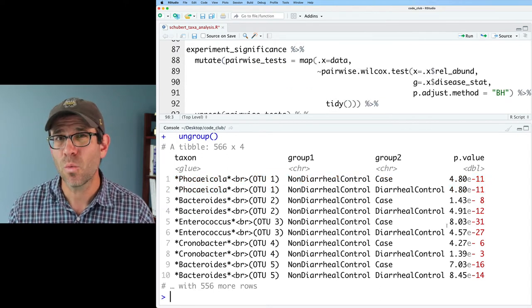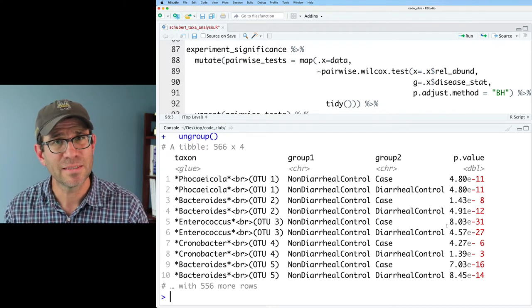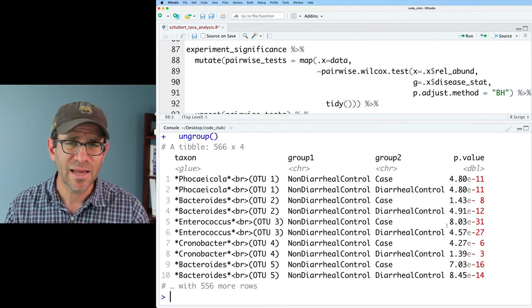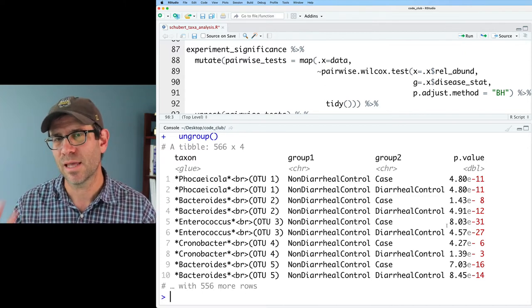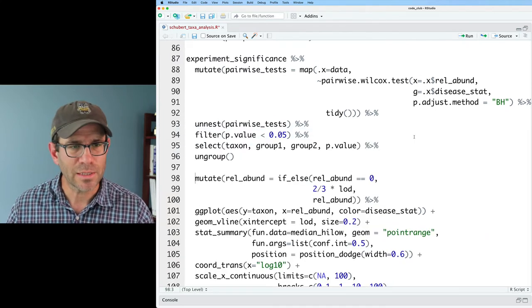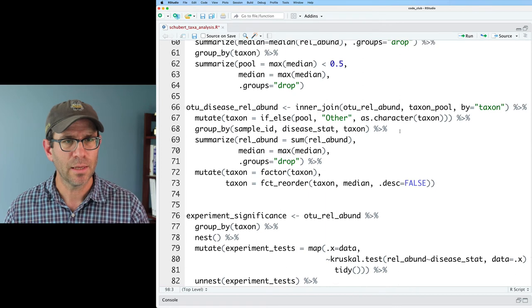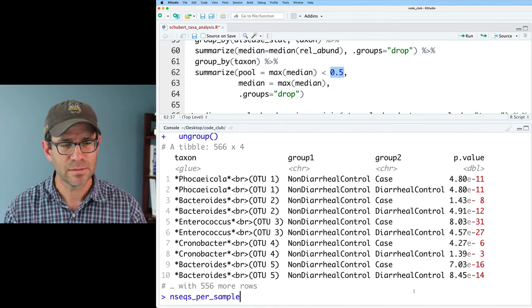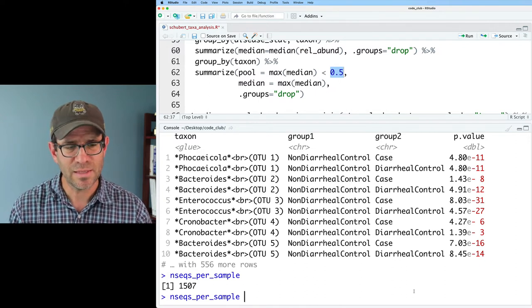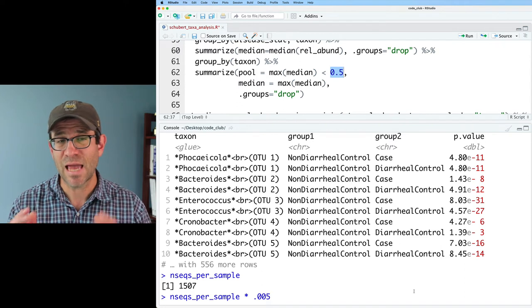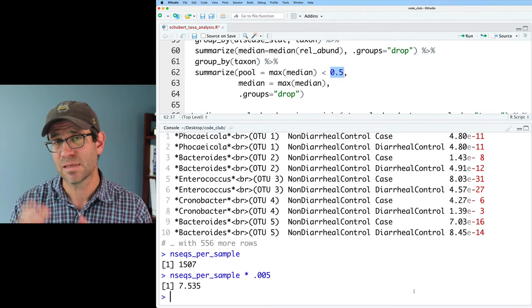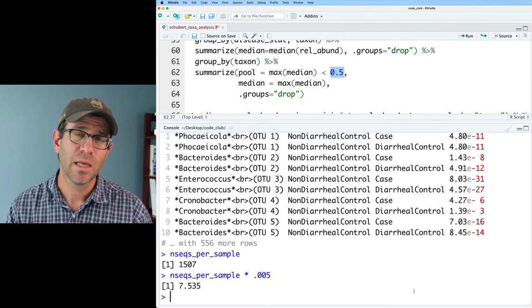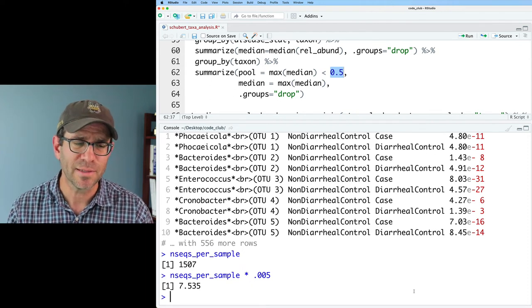In general, I think we're going to want to use a combination of both statistical significance as well as abundance-based significance. One of the things that I come back to frequently is the idea of like how many counts does a relative abundance represent. So for example, if I do my pooling at 0.5%, I had nseqs per sample, so 1,507. So nseqs per sample times 0.005, so that was half a percent. So that's representing about seven and a half sequences as the median number of sequences per sample, if I was looking on a per read basis, rather than a relative abundance.